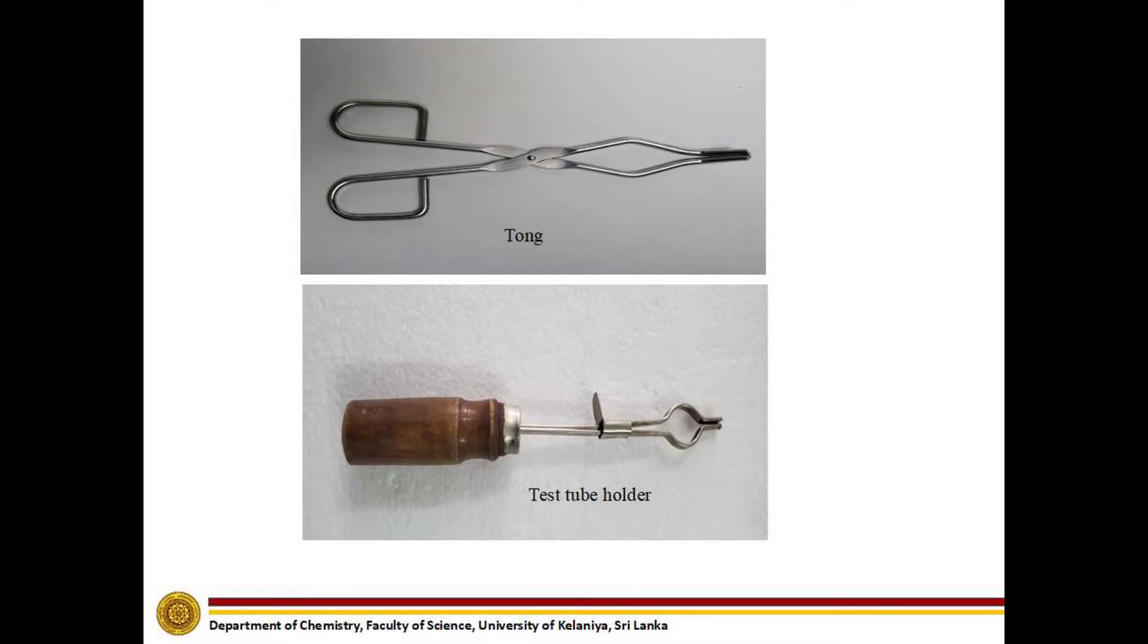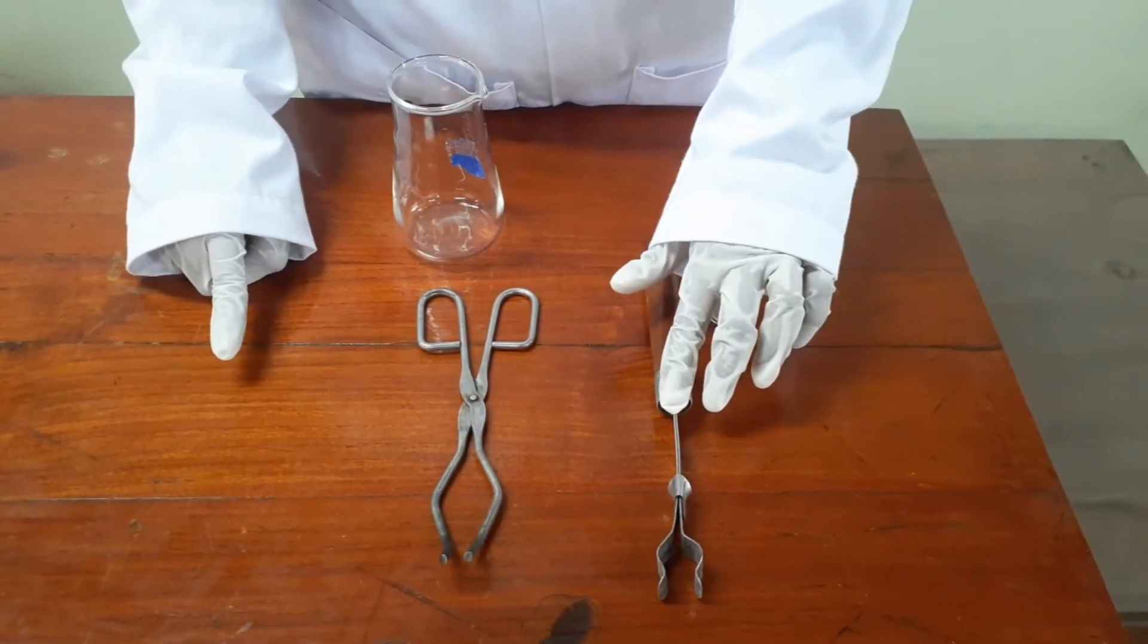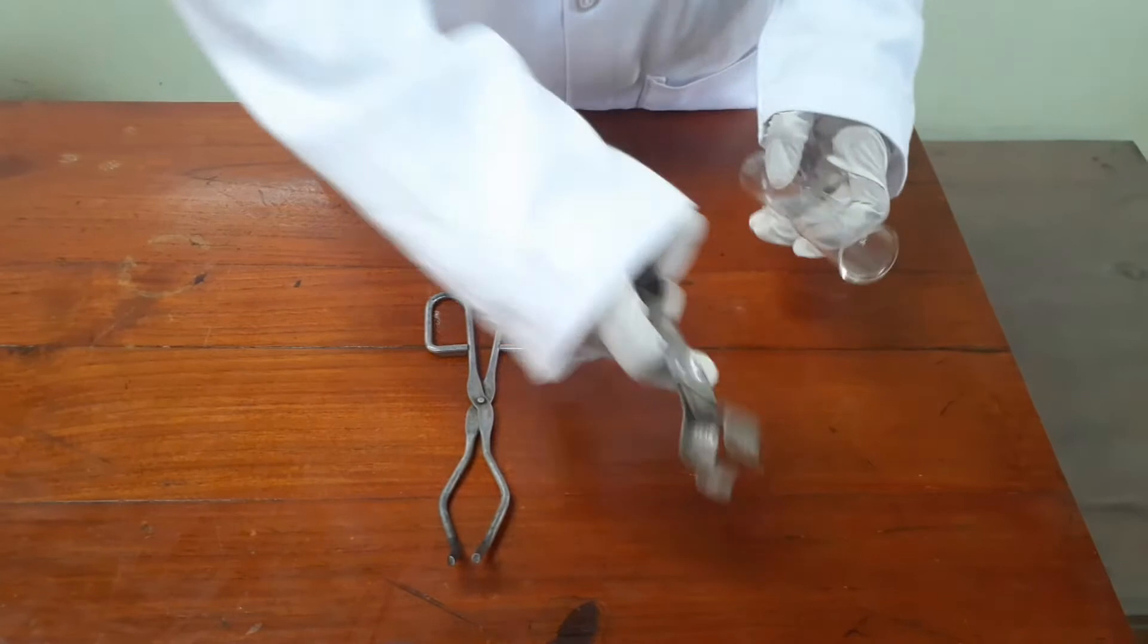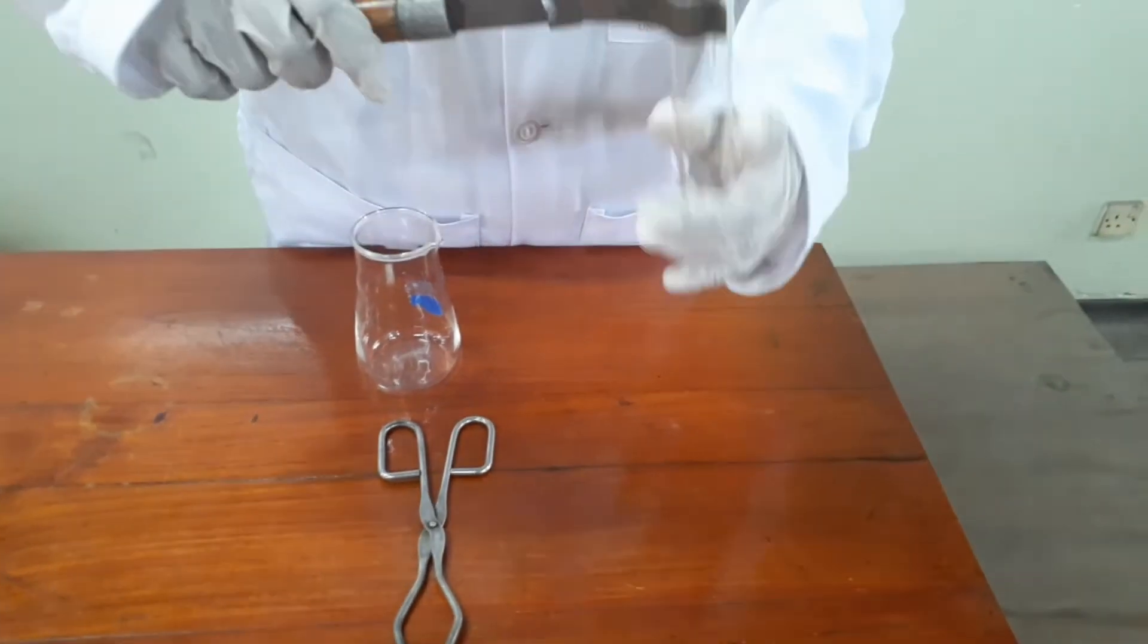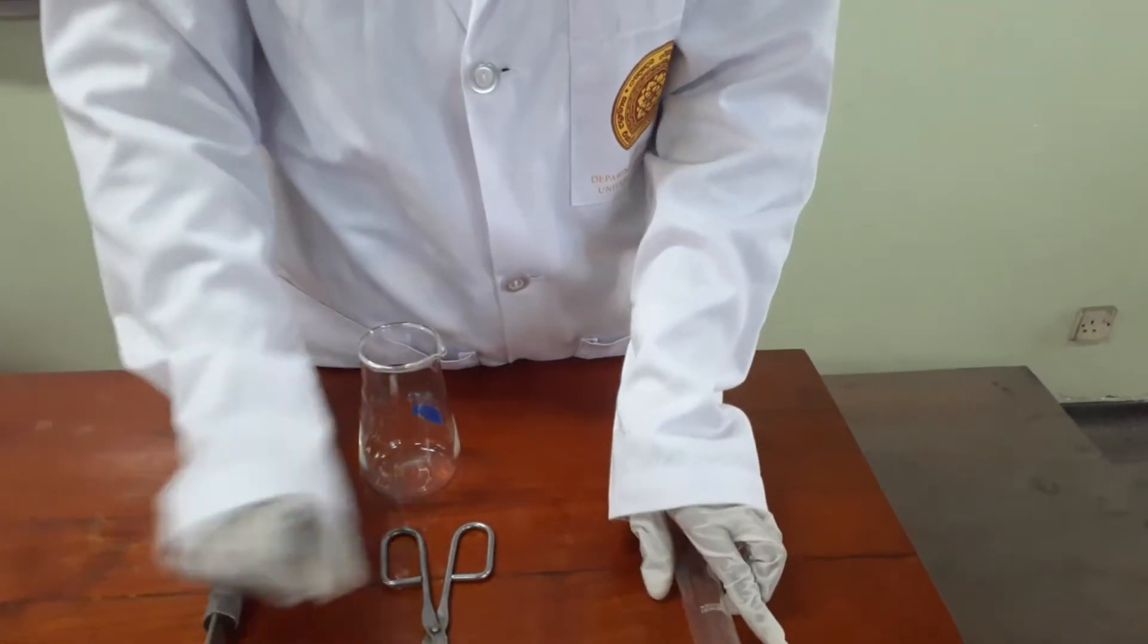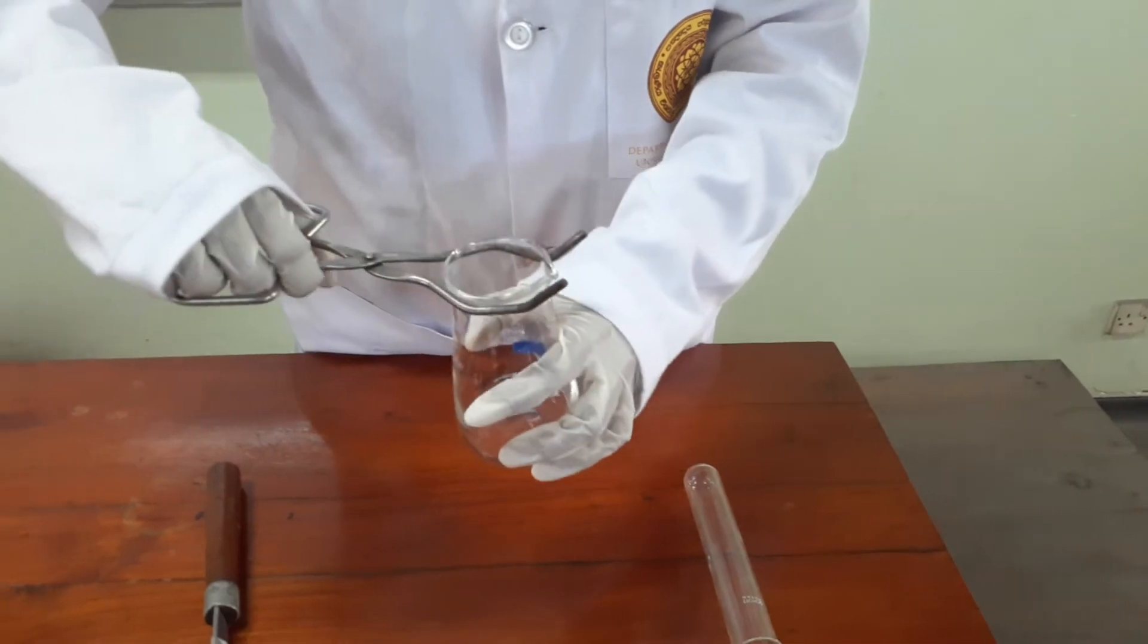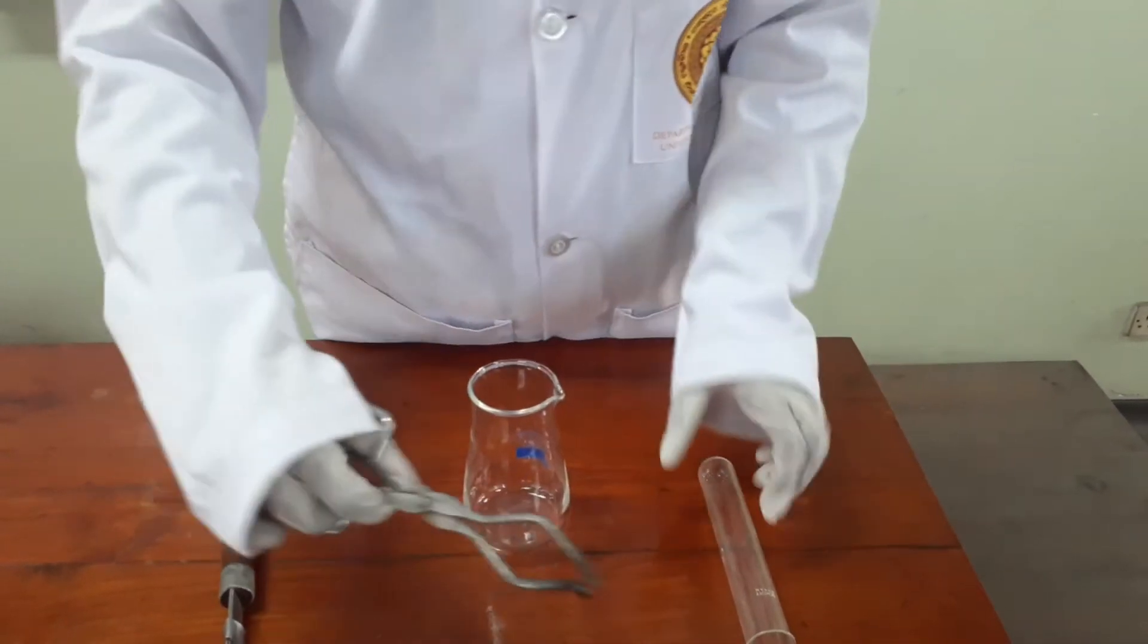Let's identify the difference between tongs and test tube holder. This is the tongs and this is the test tube holder. We use test tube holder to hold boiling tubes when we are heating a solution which is in a boiling tube. And we use tongs to hold a beaker when we are heating a solution in a beaker.